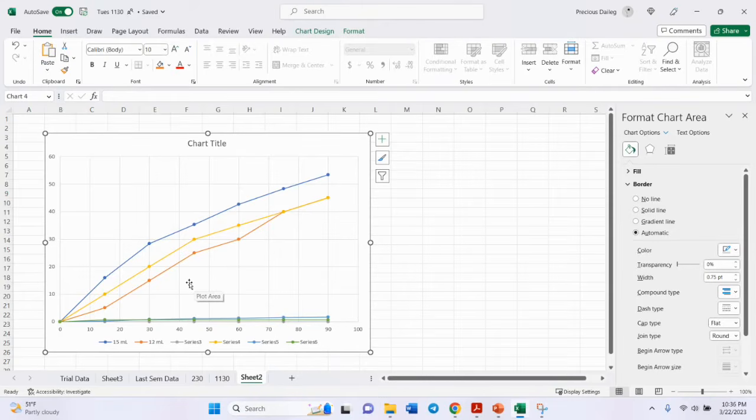And for this particular example, they all seem to fall around this area right here. So if that's the case, then you can use that data point. If you're ever not sure which data point it is, just hover over the data point and then it tells you the x and y coordinates there. So I'm going to take this portion of this graph. So first let's focus on this one, right?